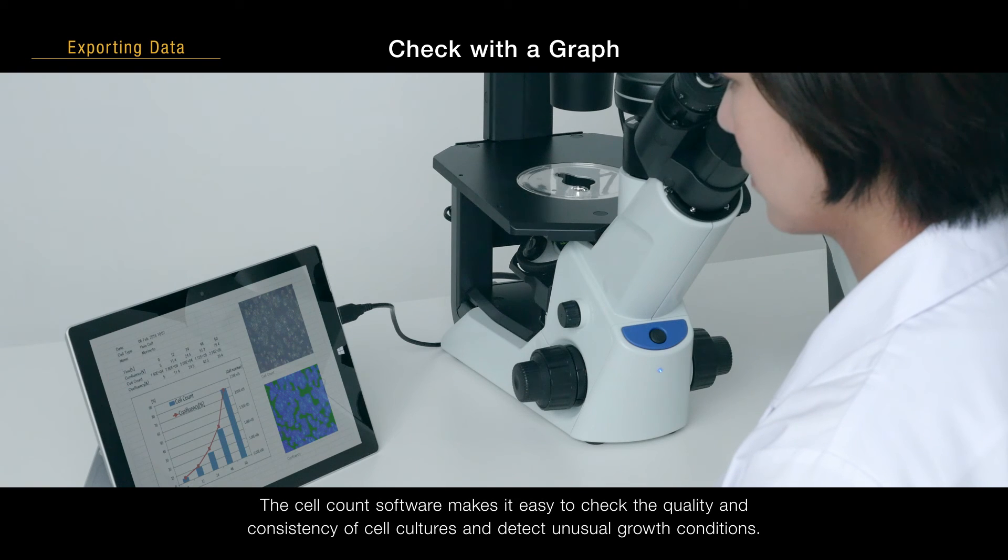The cell count software makes it easy to check the quality and consistency of cell cultures and detect unusual growth conditions.